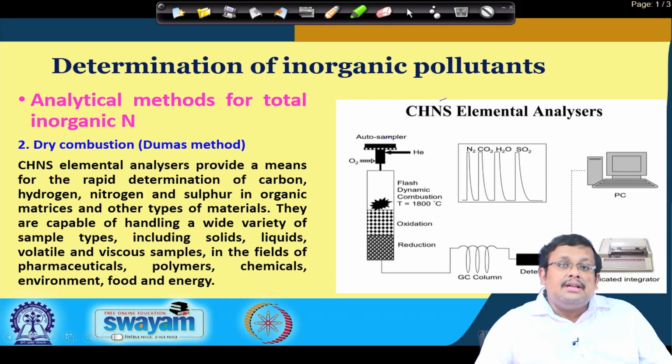Now, the second method is known as dry combustion, and this method is based on the Dumas method.